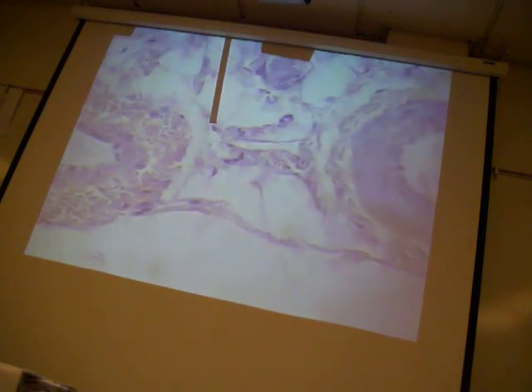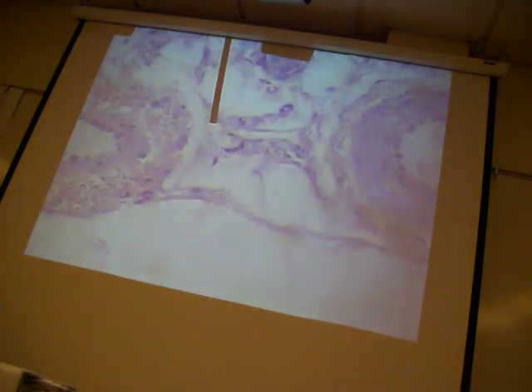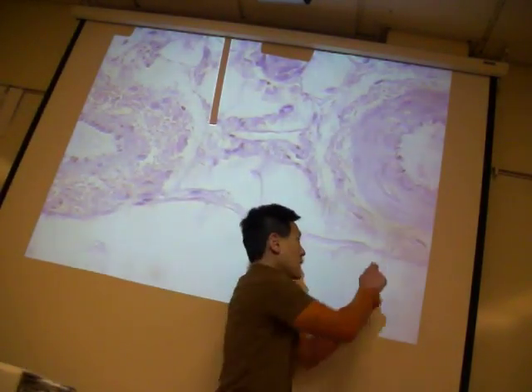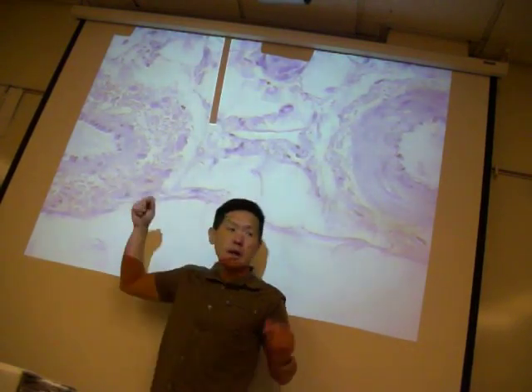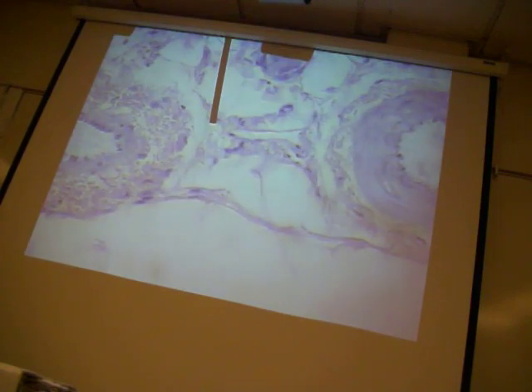All right. So here's an artery. Okay, artery's here, the vein's over here on this side. All right, so here's your picture that you want to photograph. Okay, paparazzi. This is the one that you want because they're both on there for you. Okay, you don't have to go hunting fish. You only have half of each one.